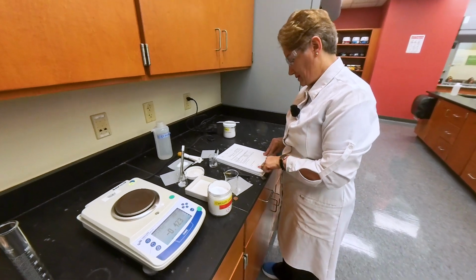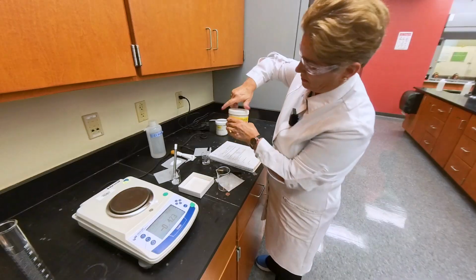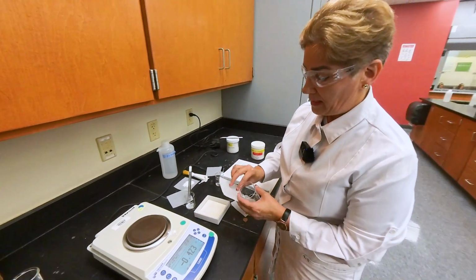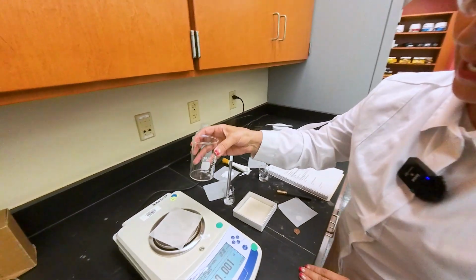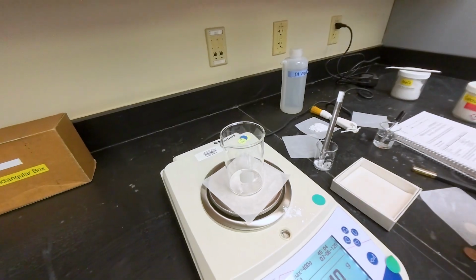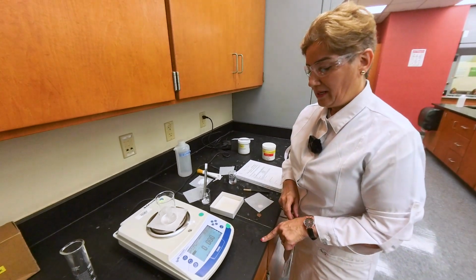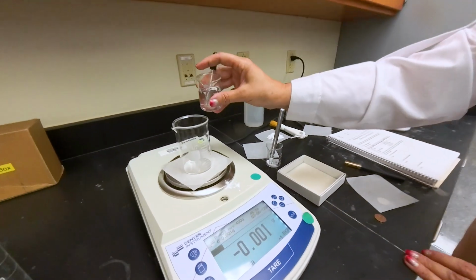Our next item is 22 grams of water. To measure 22 grams of water, of course, I do need an empty container. But again, because it's measuring out, I do not need the mass of the container. I only need the mass of water to be exactly 22 grams. So I press the tare function again and start adding water until it is 22.